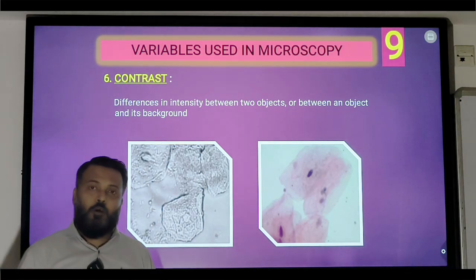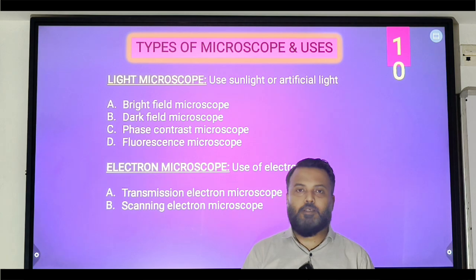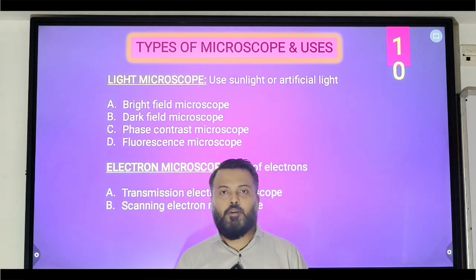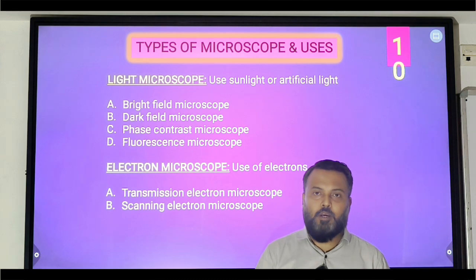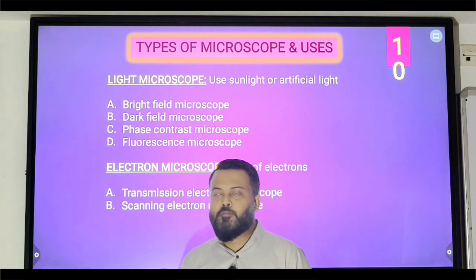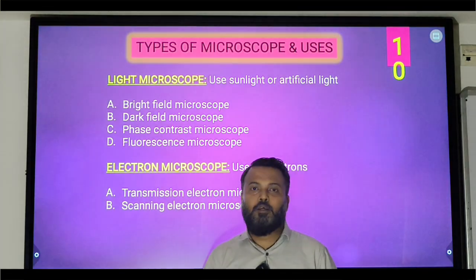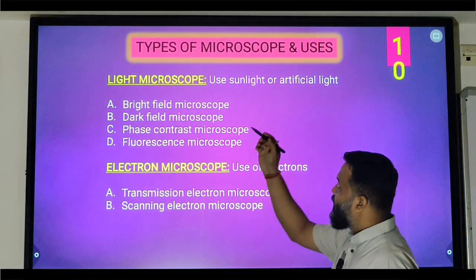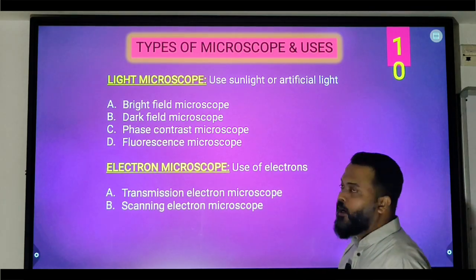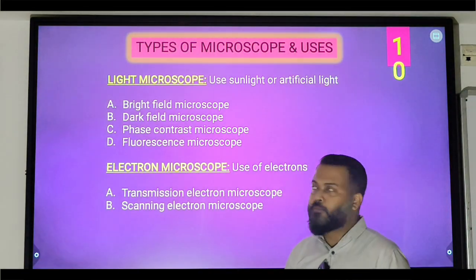that are being used in normal microscopy, and further we will have to discuss the types of different microscopes and certain common microscopes that are normally used in research laboratories. So before moving into it, let us first start with the types of microscope. So the first, actually, microscopy is mainly divided into two types. One is light microscope and the other one is electron microscope.